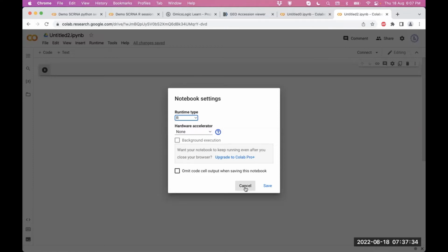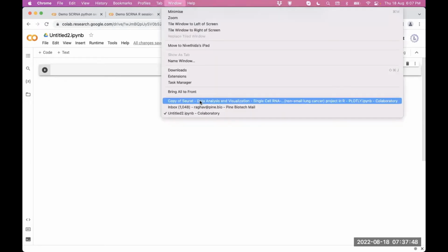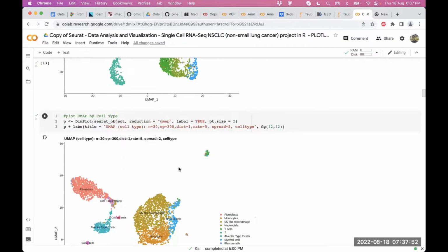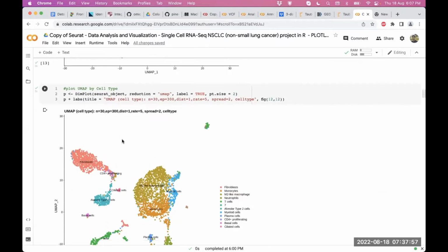Okay, so we cancel a save. It does not matter. We get out of this. So what is the power of using such a Colab's environment? One of the important advantages, for example, you can see at some of the copy of Colab notebook. You can write some codes and get an output right below that. And such level of linking the output to a specific code is not very easy in any other development environment or tool that you are going to use.